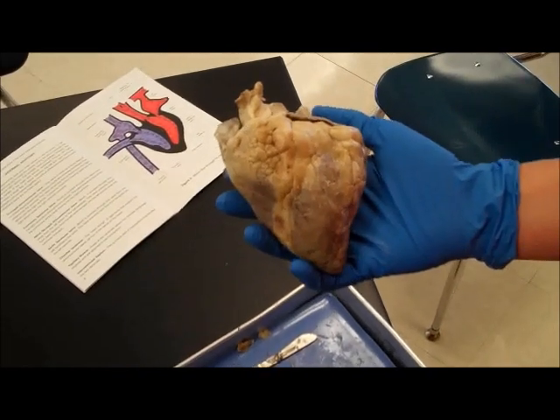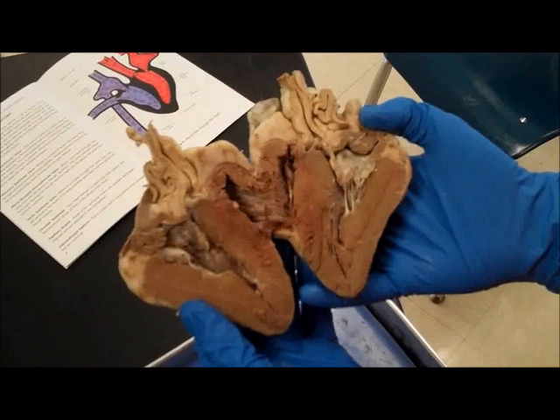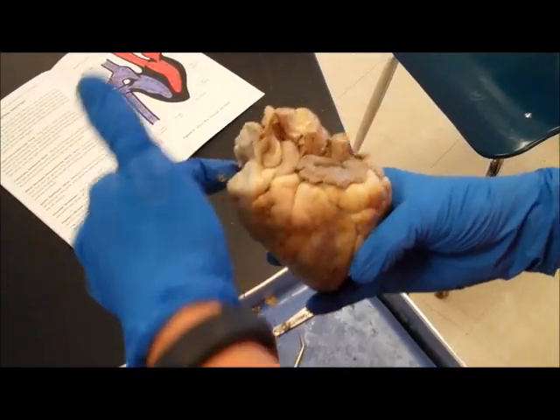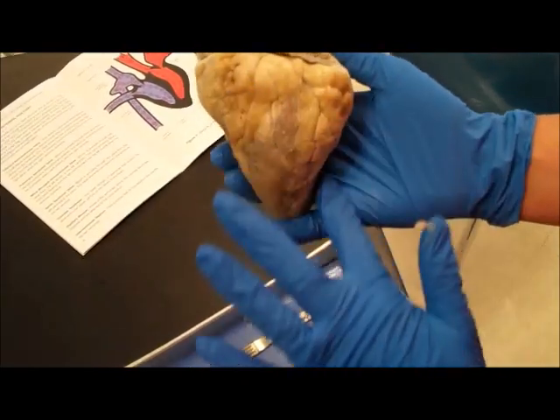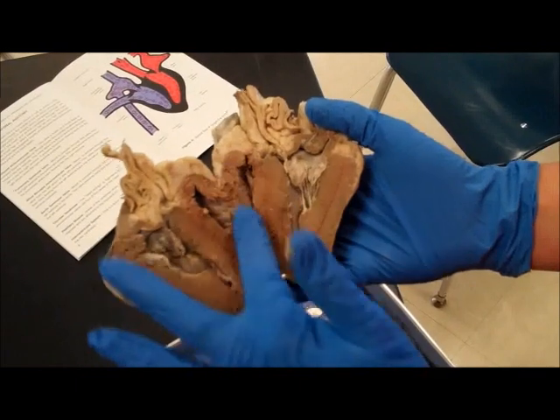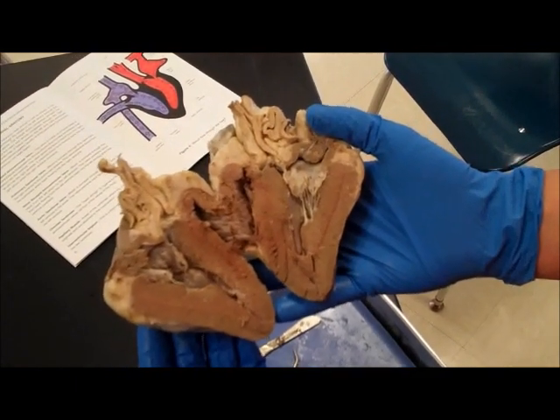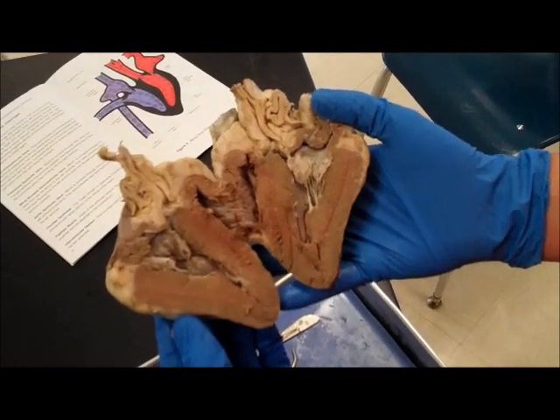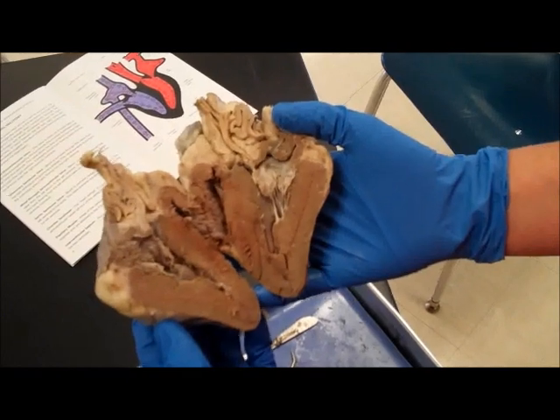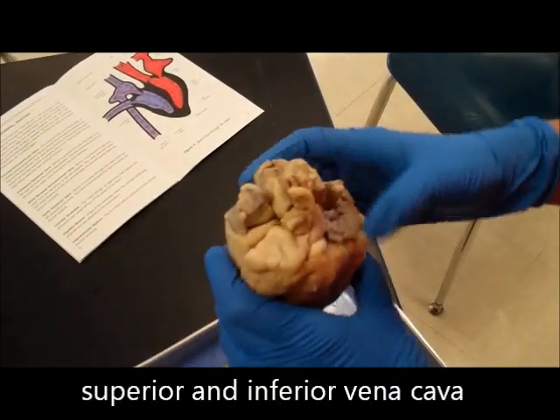All right, so we're going to open the heart up just to get a quick glance inside at what we're looking at. We've taken the heart and cut it from the right atrium all the way down and around to the apex of the heart, making it open up like a book, but keeping part of the heart intact so that we can still put it back together to see what we're doing. So blood is going to flow into the heart through our vena cavas. You have a superior and an inferior vena cava, and they're going to flow into the right atrium.